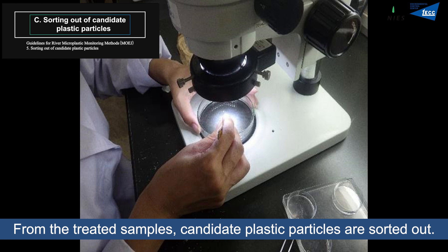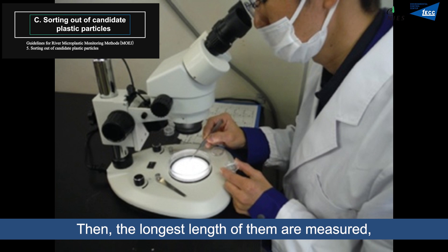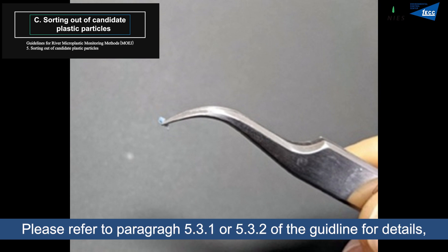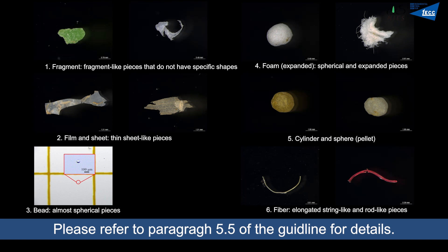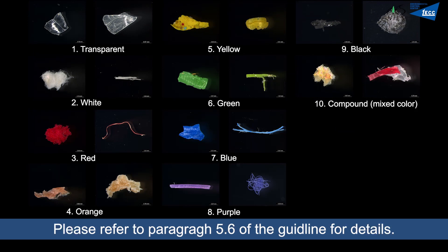From the treated samples, candidate plastic particles are sorted out. The longest lengths of the particles are measured and they are sorted by shape and color. The longest length can be measured visually or by image processing. Please refer to paragraphs 5-3-1 or 5-3-2 of the guideline for details on recording individual particles. These are examples of shape categories — refer to paragraph 5-5 of the guideline for details. These are examples of color categories — refer to paragraph 5-6 of the guideline for details.